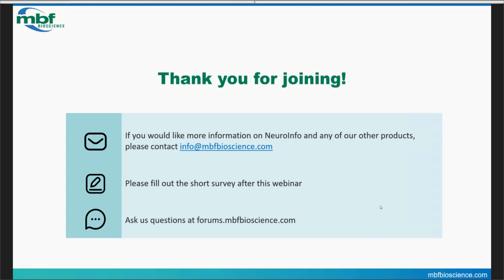Yeah, and I think there's some information about what type of plastic to use for the printing, right? Because you found that early on there were some porous ones. Yeah, it's very important the type of media that's used to do the printing. This is because some of the media that we used absorbed the liquid, and that's a problem. That's all listed in the information that's provided. Cool. That's all on the forums here. I've got the link to that here.